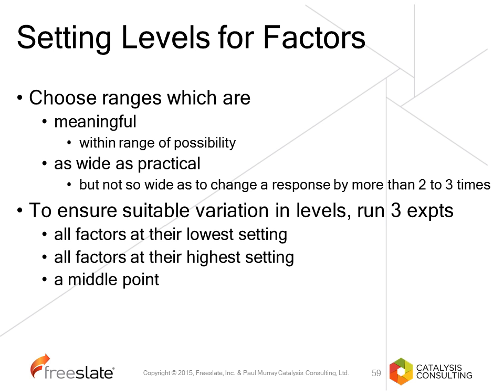So if all the factors at the lowest setting or the highest setting give you an outcome where the reaction has not worked, then you know that there is a problem, that you have either too low a setting or too high a setting. So at high setting, maybe you have decomposition and impurities. At a low setting, maybe you do not have things hot enough for the reaction to progress. So if you have those, you can change the set point for the rest of the design.